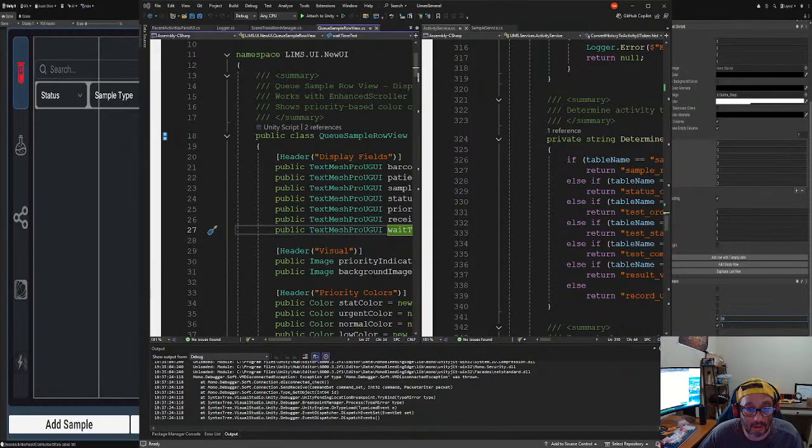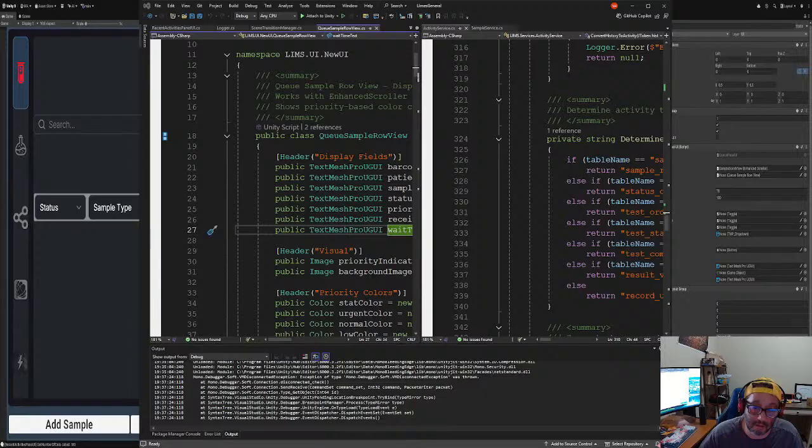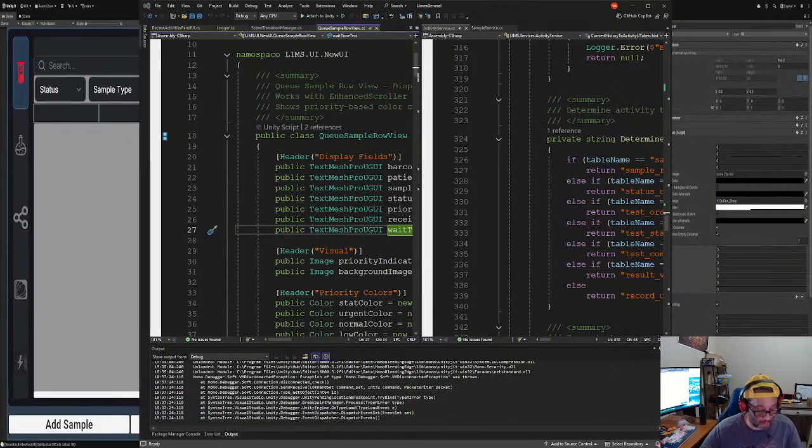Okay. We want the Q. We're gonna put this on top here. Panel filter right here, and then we're gonna put the Q, and we're gonna do a layout, vertical layout group, right? We want it to be like this and like that. There we go. Now the same as before. Table layout. We're gonna do Q row view, Q row view prefab. Right?